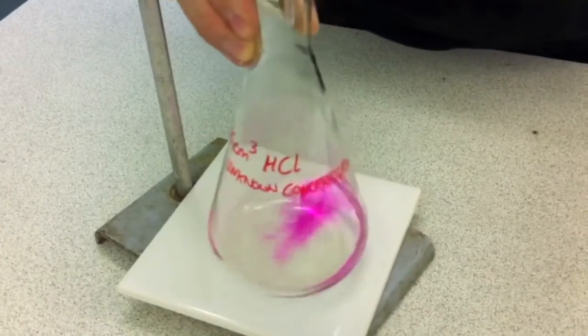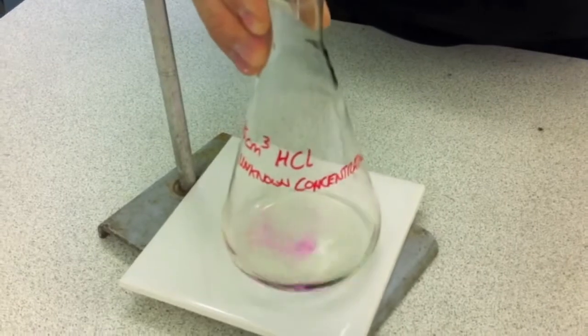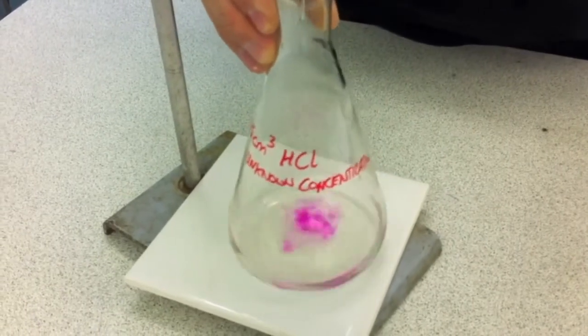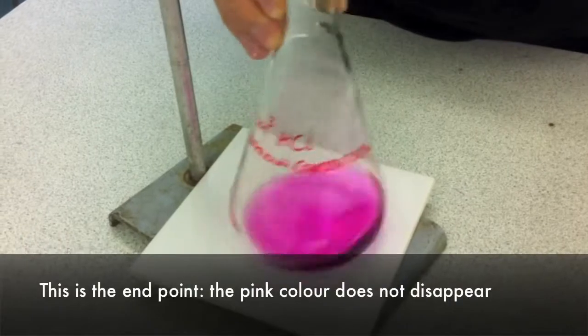Like magic, the solution can go from vibrant pink to entirely clear and then back to pink until it finally reaches a stable state.